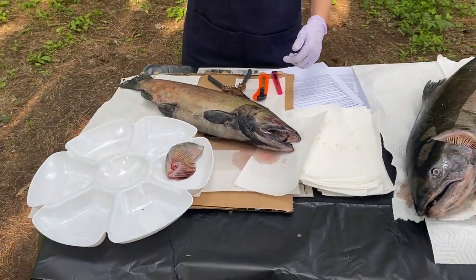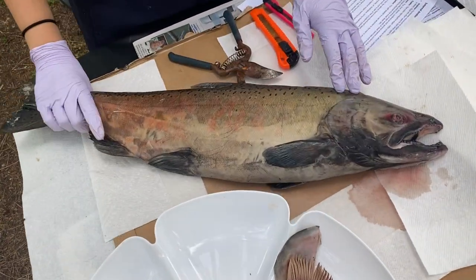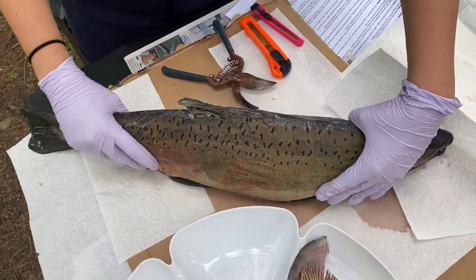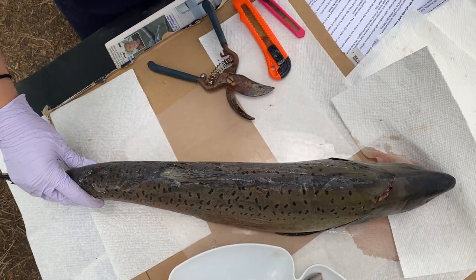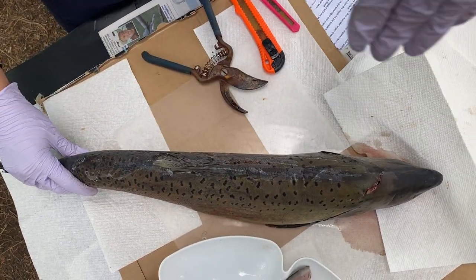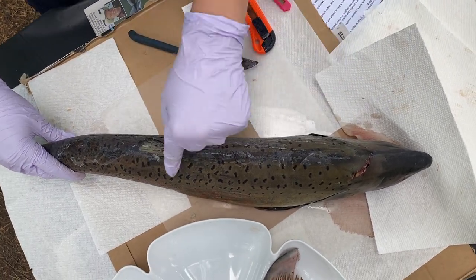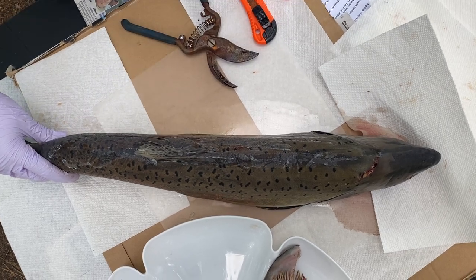One thing I should talk about too, sorry this is a little jumpy, but the coloring of the fish. So the coloring of the fish is super important. It's called cryptic coloring, so it's all about camouflage. So if you were a predator and you were going to try to eat a salmon, and you're swimming above the water and you look down, you're going to see all these tiny little dots or spots, and that is going to blend in really, really well with the gravel on the bottom of the river.